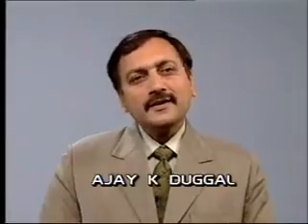Hello once again. Continuing our series in public health engineering, in this program we will see how to measure the optimum dose of coagulants.